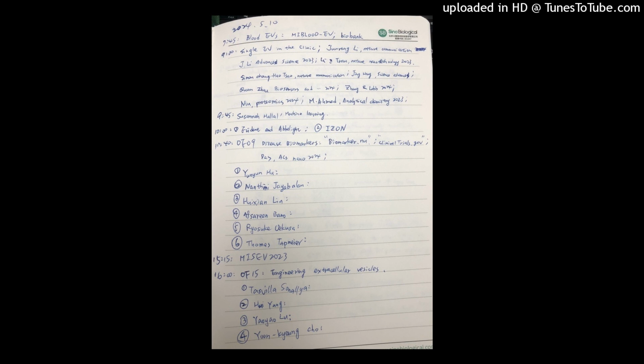Similarly, we exploited an FCM with a strategy with light steric hindrance to validate their expressions. We used 2 dye-conjugated antibodies for recognition and used an FCM equipped with 2 lasers for analysis.